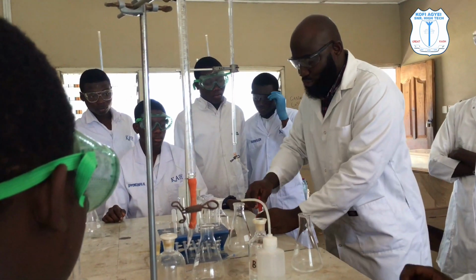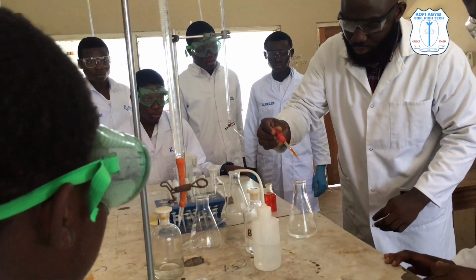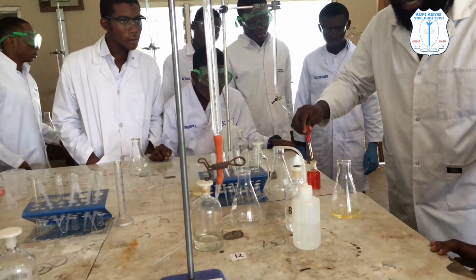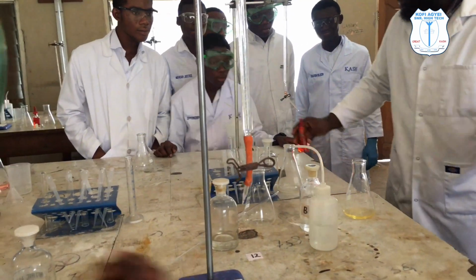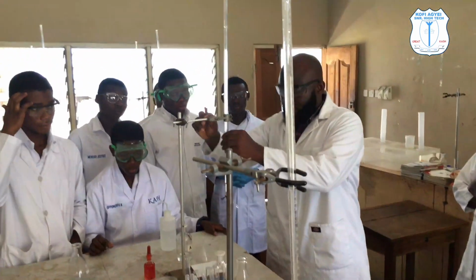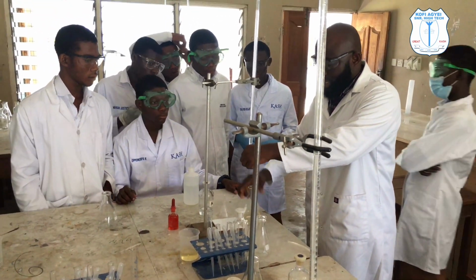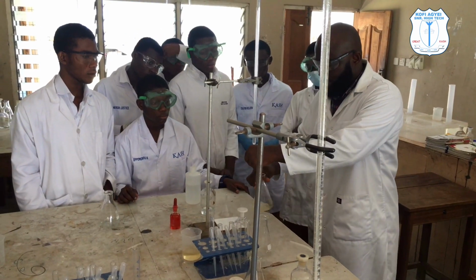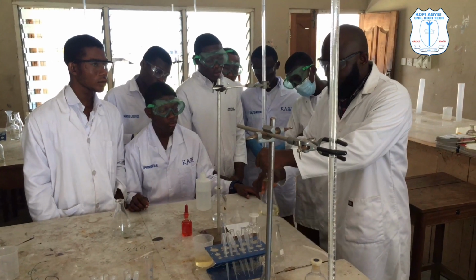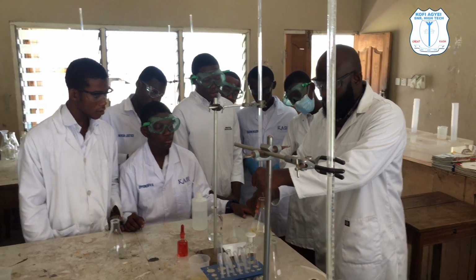Now the next step, what are you going to do? You are going to add 3 drops of the methyl orange indicator. 1, 2, 3. So the next thing is to start with the titration. So here your left hand is over here and your right hand on the conical flask. You're going to release it gently into the conical flask. So always let it flow in drops. Understood?